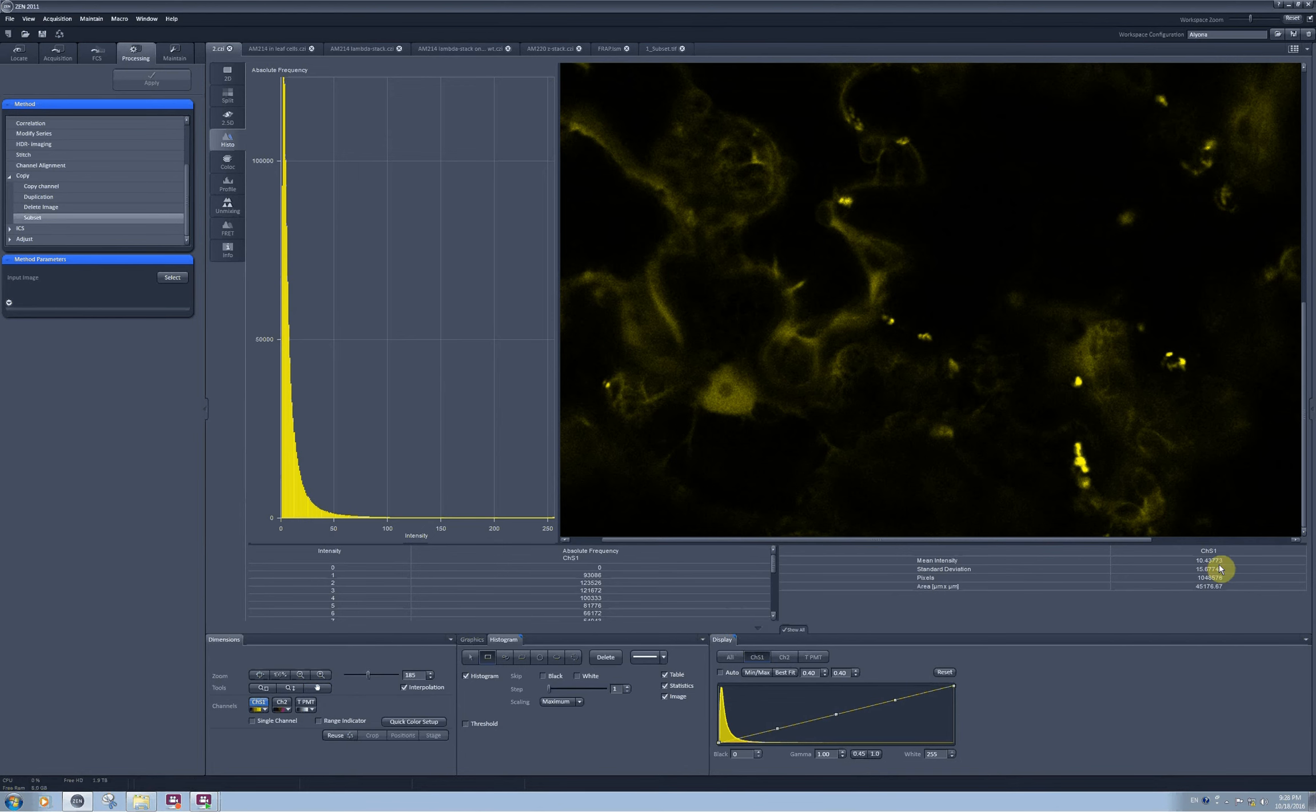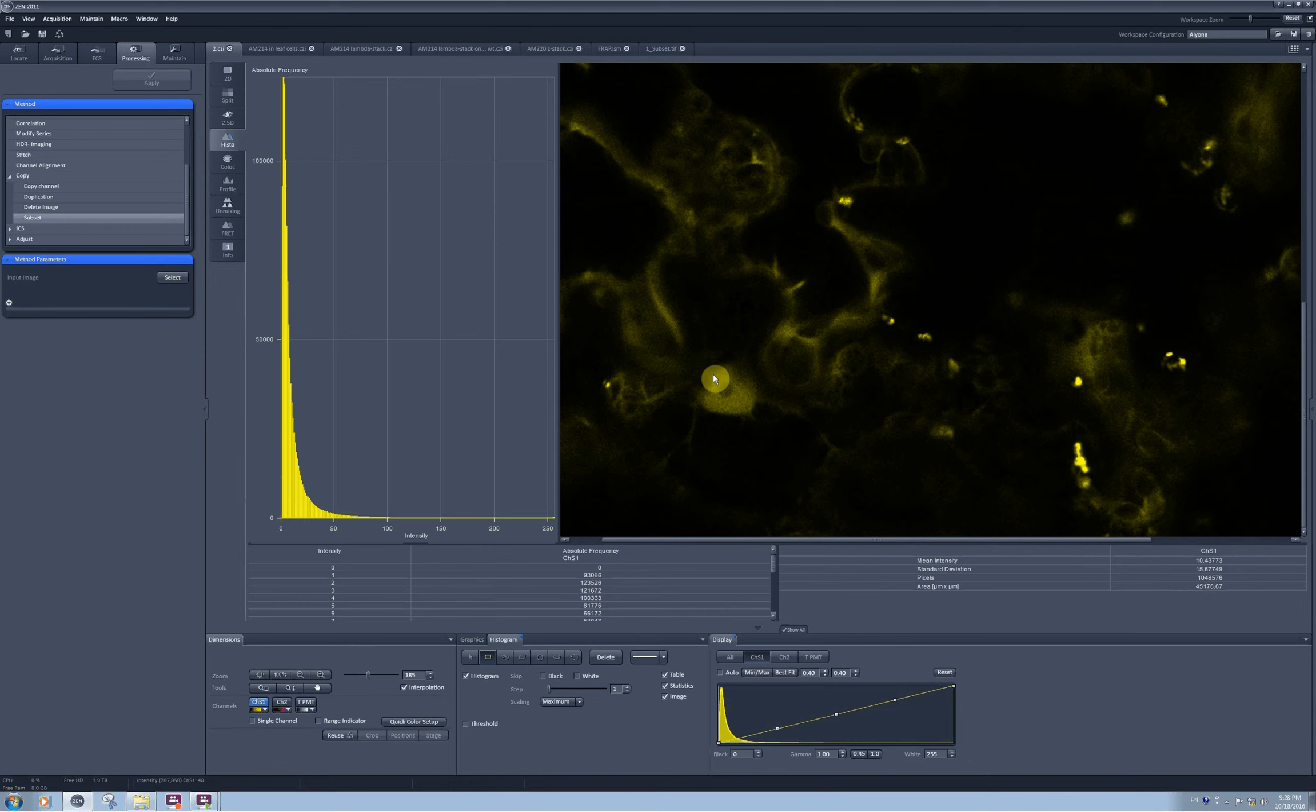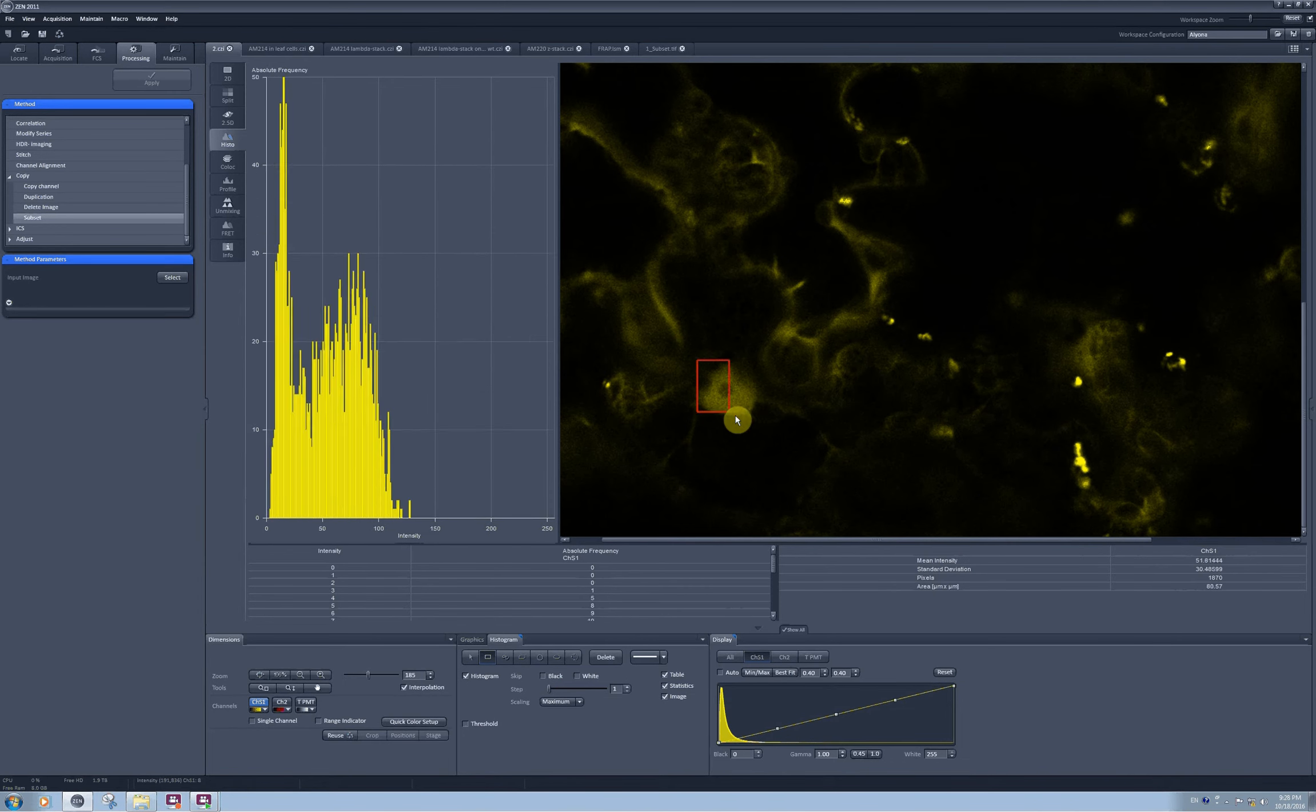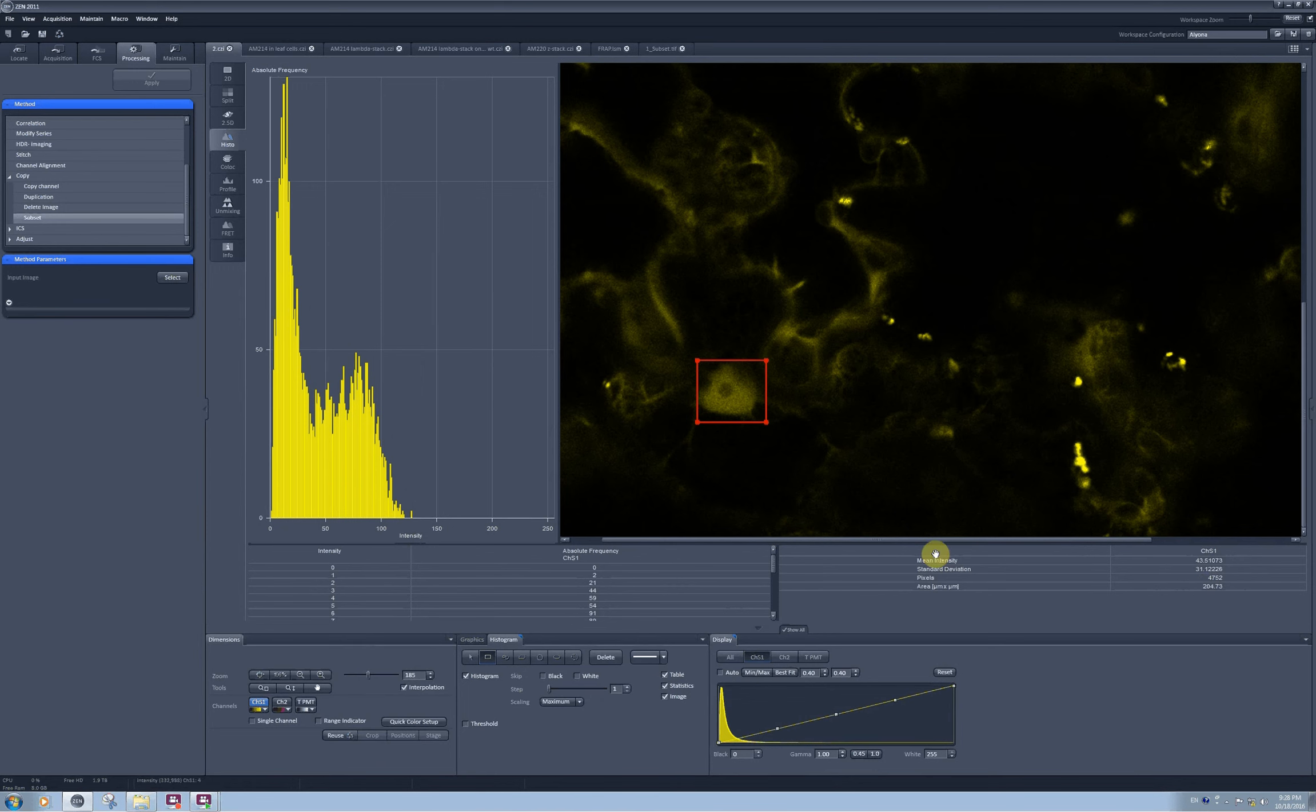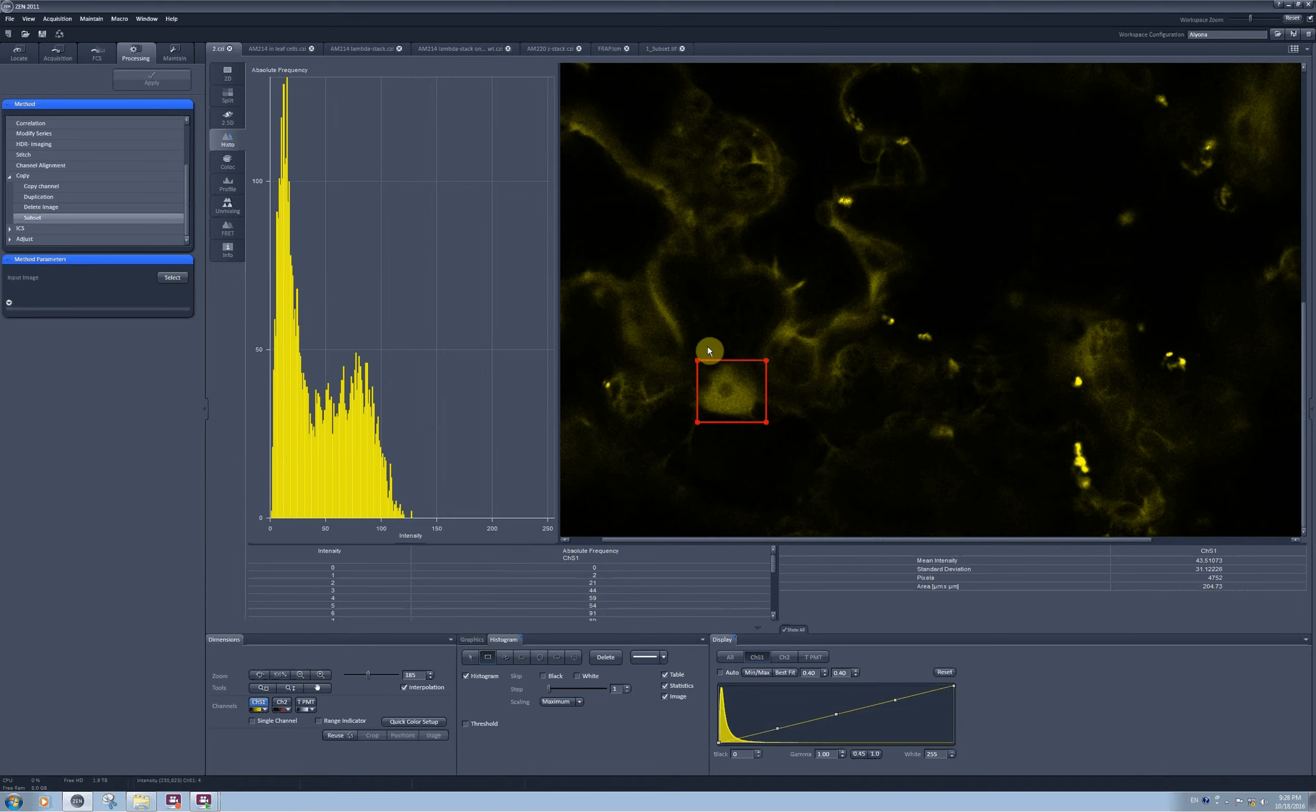Currently the software estimates mean intensity for the whole image and I have 45,000 square micrometers worth of measurement. When I select a small rectangle, the area is immediately changed to the area covered by my region of interest which is within this rectangle now. It's only 204 square micrometers and this is the mean intensity within the square and this is the standard deviation.